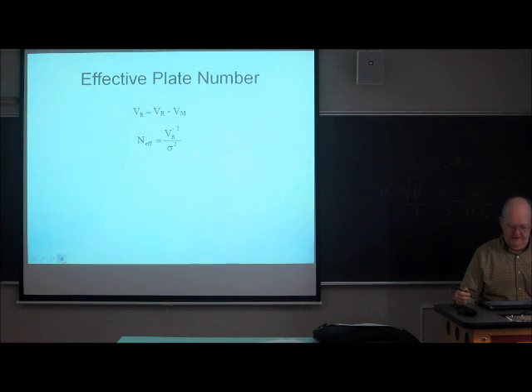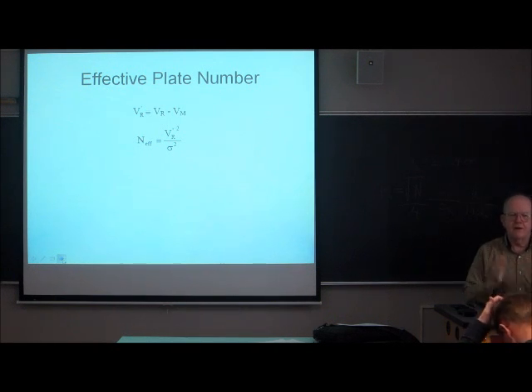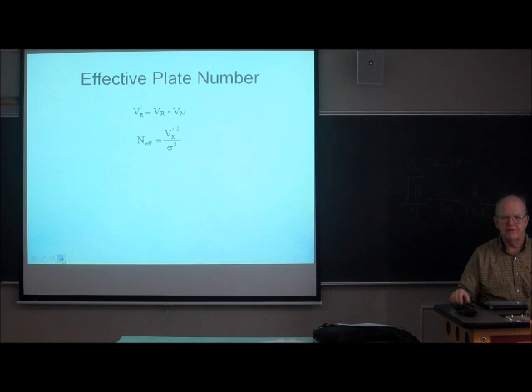Okay, effective plate number. There are 2 different ways to look at this. The first way, and the simplest way, is the following. During the dead volume, when the solute is in the mobile phase, it's not separating from the other types of molecules in the sample. It's just being transported in the mobile phase. And no matter what kind of molecule you're dealing with, they all spend the same amount of time and the same volume in the mobile phase.